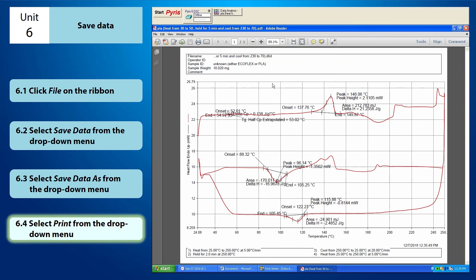Now, your PDF file is ready. Okay, that's all for this tutorial video and good luck in using the Pyris 6 DSC software.